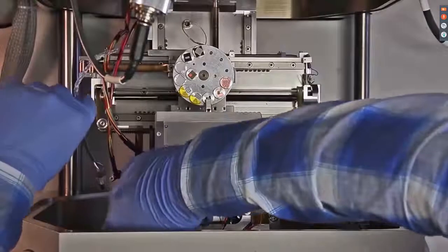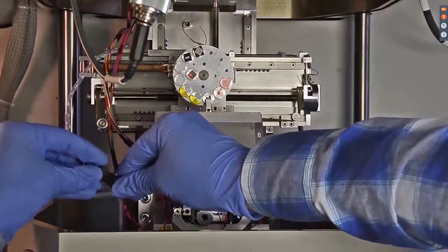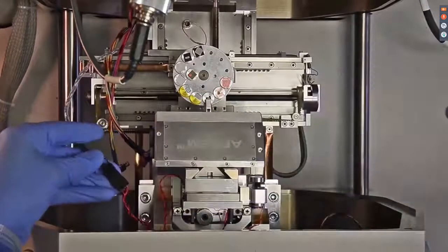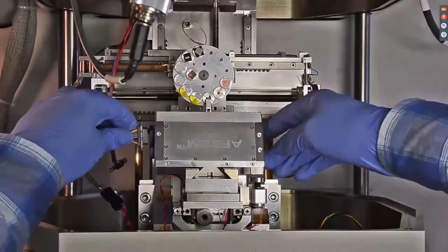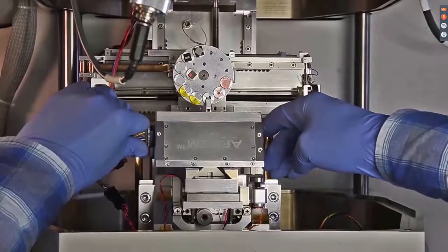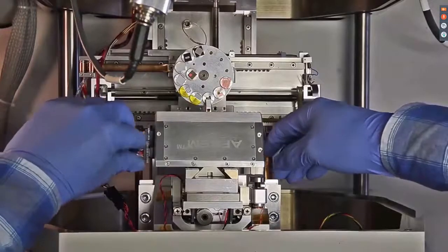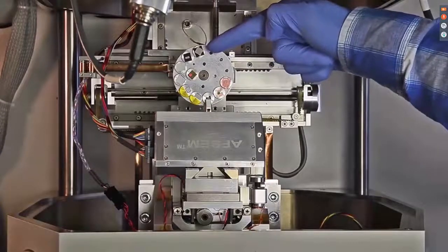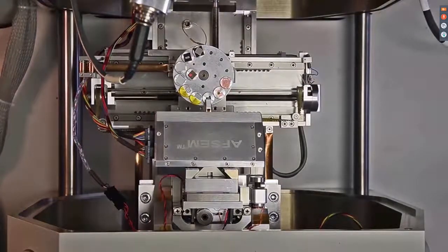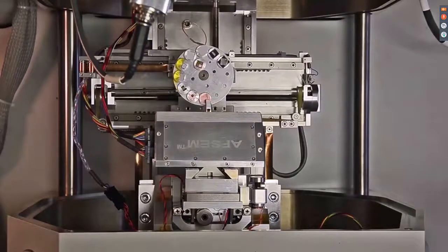Before pumping the system down, make sure to connect the electrical wiring to both the stage and the AFSEM scanner. If you use a large sample holder with many SEM stubs, as in our case, or a large sample such as a 4-inch wafer, you can roughly position the cantilever above the area of interest.